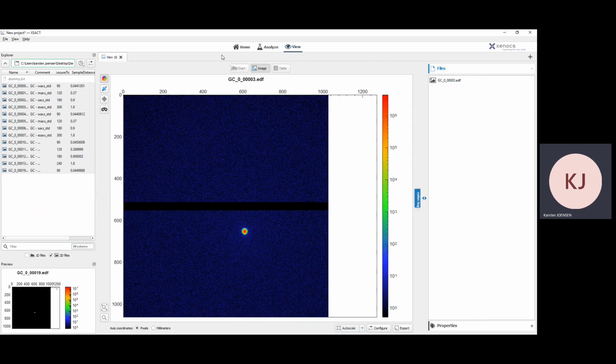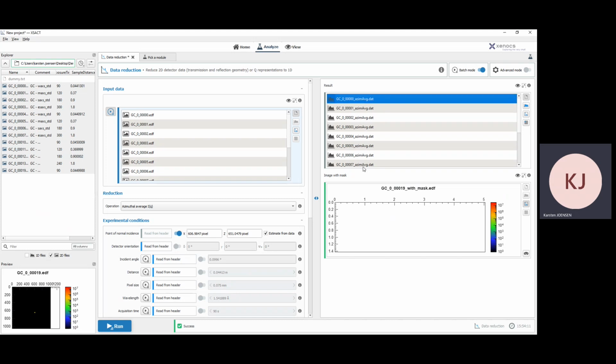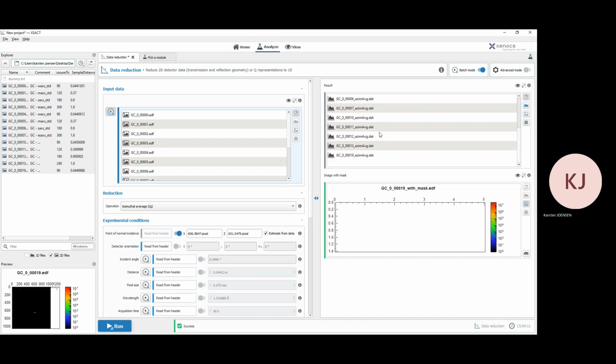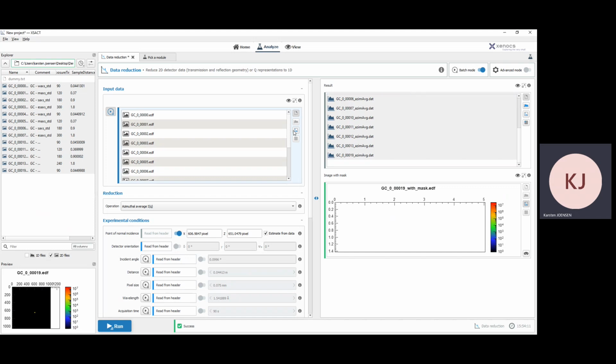Again, it's possible within that analyze to grab all of this and save all these images that we have in here, to save the 13 files and have those go somewhere else. So this gives an idea of what you can do with those.